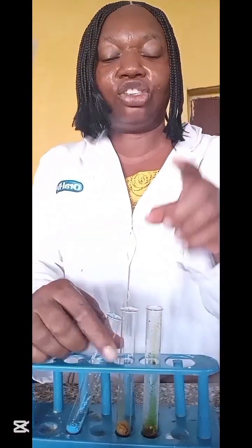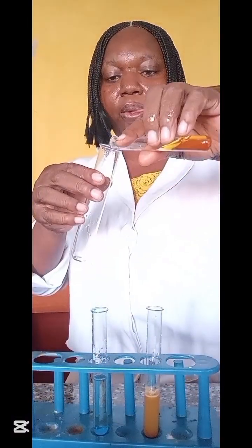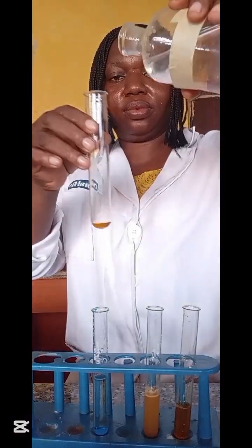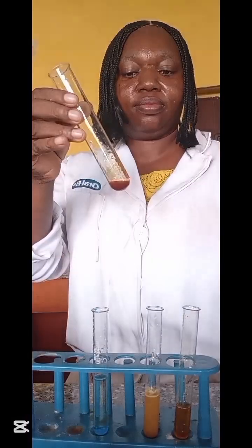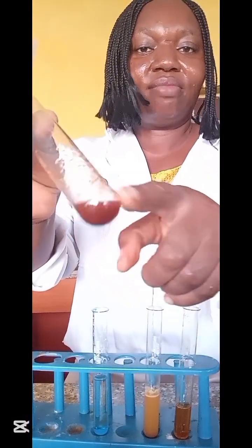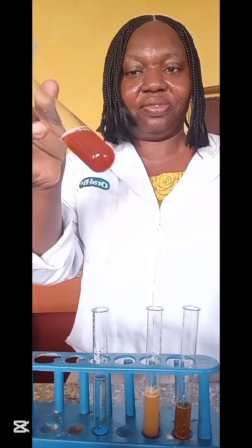Now, these are the transition metal salts. Let's test them. Let's go with this first. Sodium hydroxide. This is a reddish brown gelatinous precipitate. See the gel. Reddish brown gelatinous precipitate, that's iron 3+. In excess, the precipitate does not dissolve.